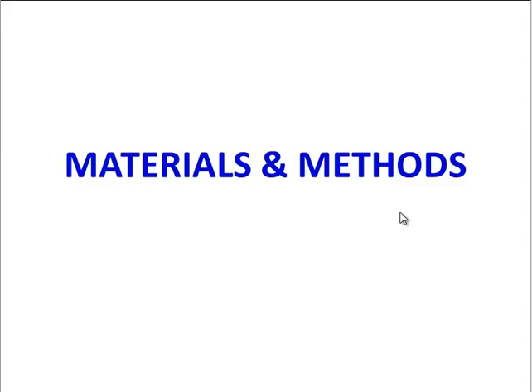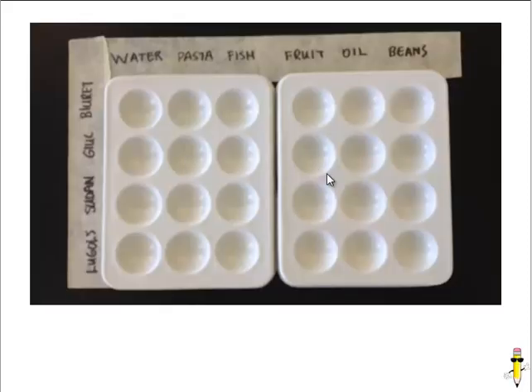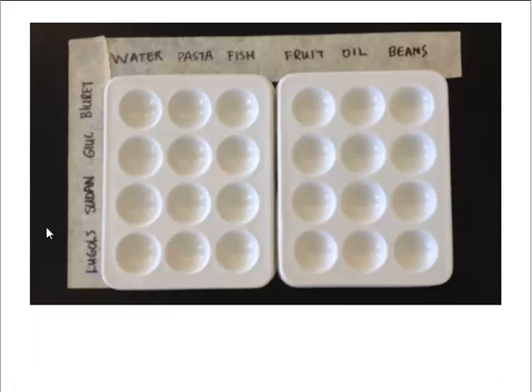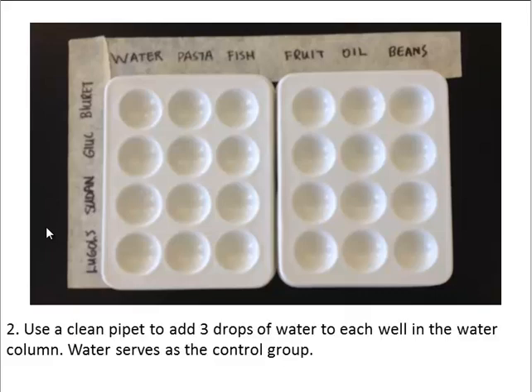Here's how the protocol will work. You're going to be using two spot plates side by side, and then use masking tape to label what is being put into each spot plate. Along the columns you'll put the different types of food, and the rows are where you will put each particular indicator. When you're ready to start, use a clean pipette to add three drops of water to each well in the water column — water will serve as your control group, since it doesn't have any nutrients, so we would expect a negative test result for all indicators.